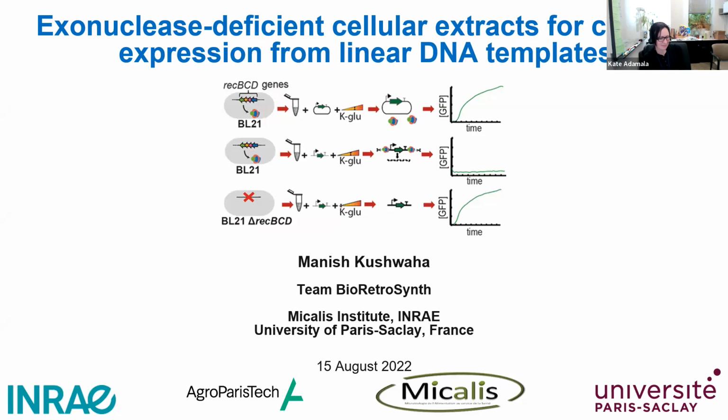It's a pleasure to be here at this seminar series, which the entire group I try to follow a lot because you guys do a lot of exciting stuff building synthetic cells. What I do is not quite in that direction yet, but we try to do small things that might contribute towards building cells. So with that, I'll start talking about the topic for the day, which is how to use linear DNA templates in exonuclease-deficient cellular extracts.